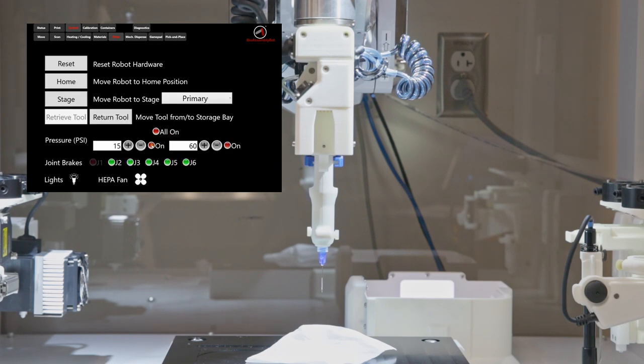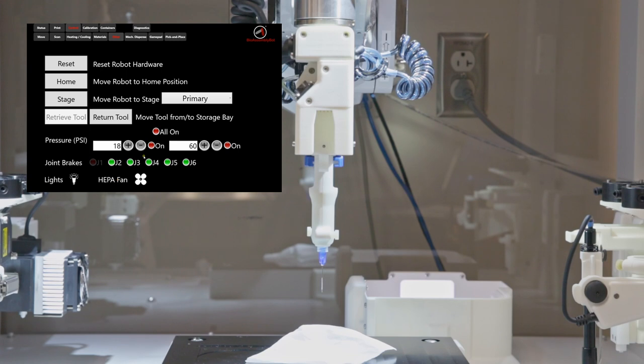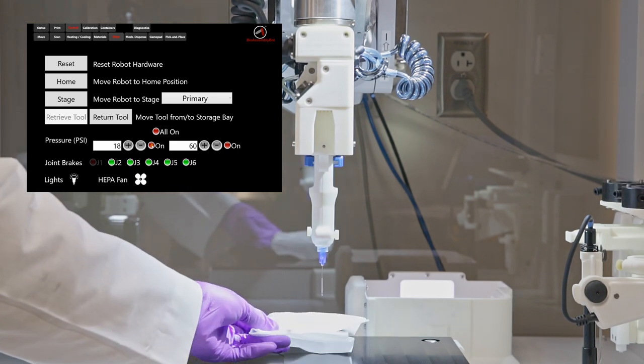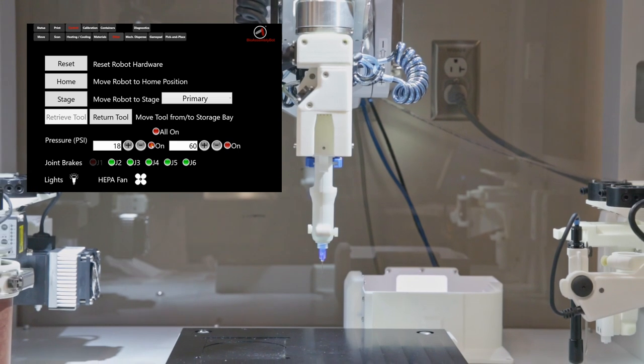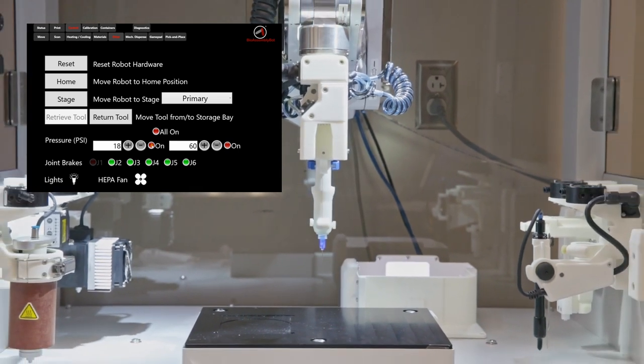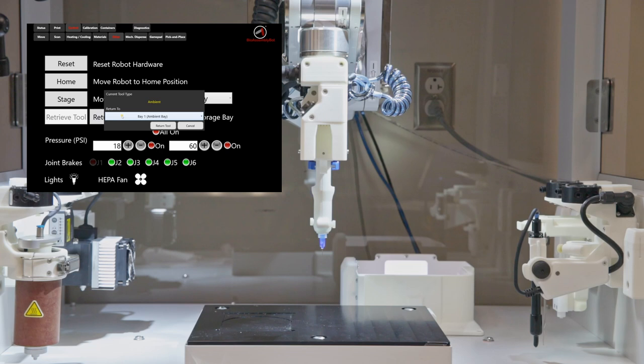Remember, the extrusion pressure changes from material to material and depends on the needle size. We can increase the pressure for printing at higher speeds. Let's try extrusion at 18 psi. As we can see, the extrusion is faster, so we can use this for faster printing. Now clean the tip and return the printhead to its bay.